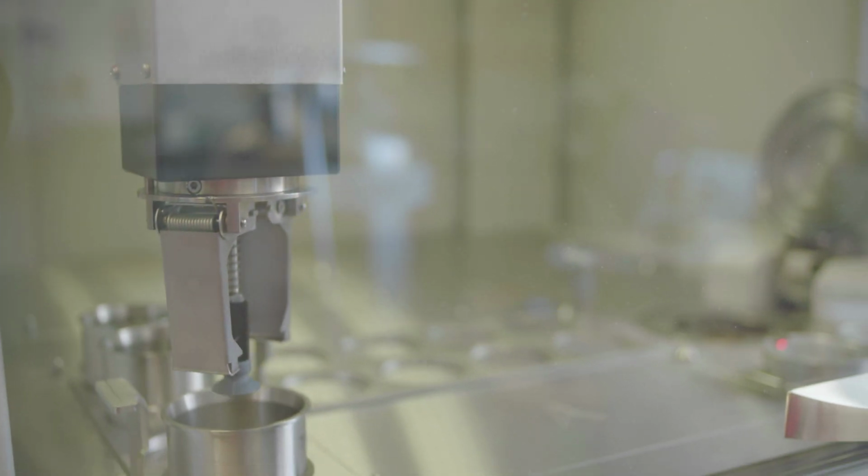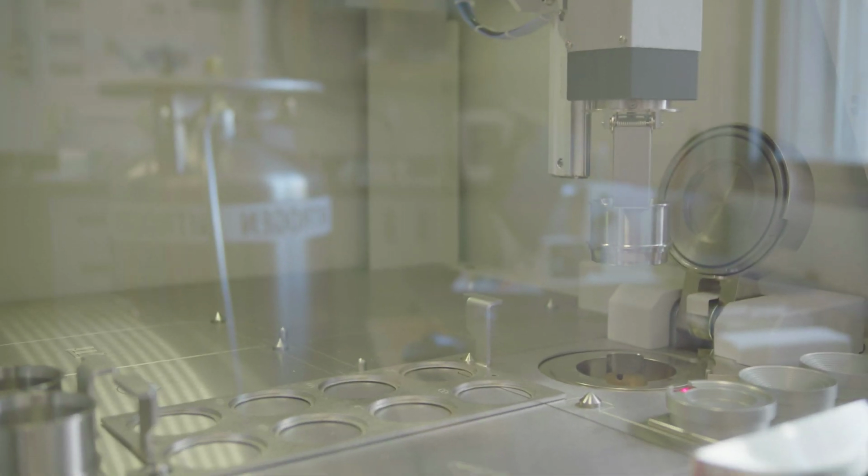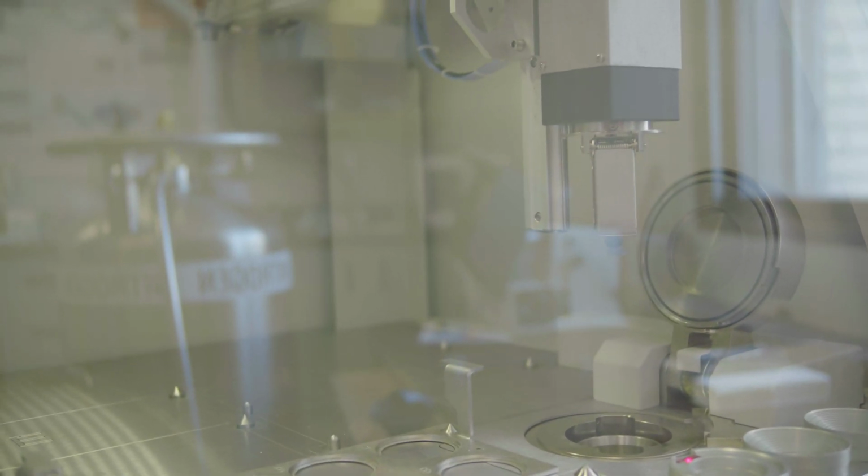How long do you run your samples for? Well, when we're trying to do really the research type stuff to really tease out the differences, we actually run every sample 3 hours. 3 hours? Yeah. The reason we run it longer is we try different energies, different targets. It's a way of using different kinds of X-rays to find different elements within the rock.